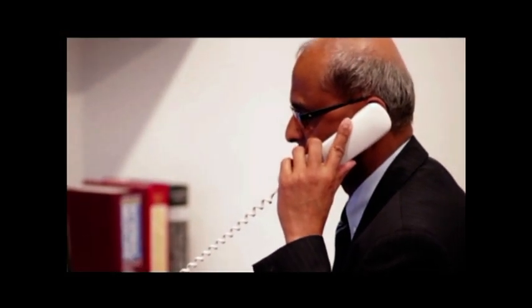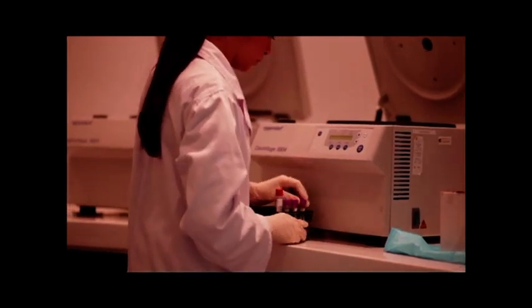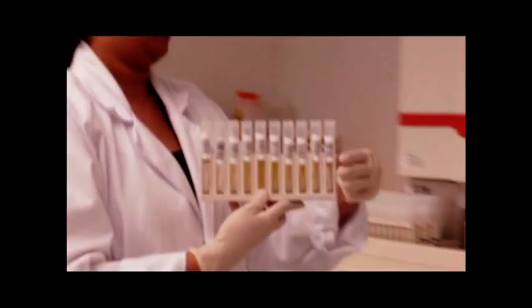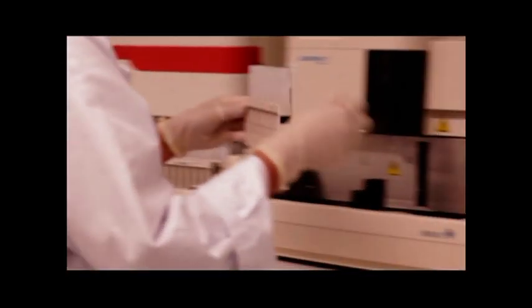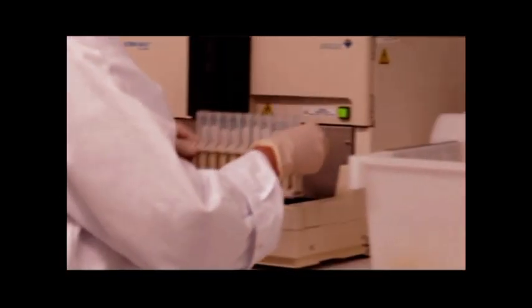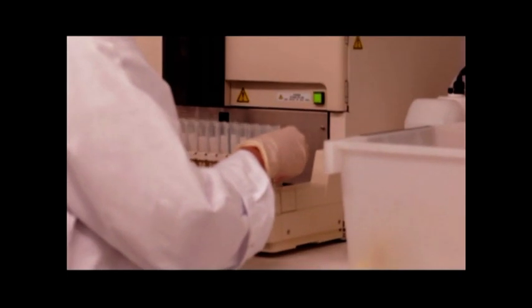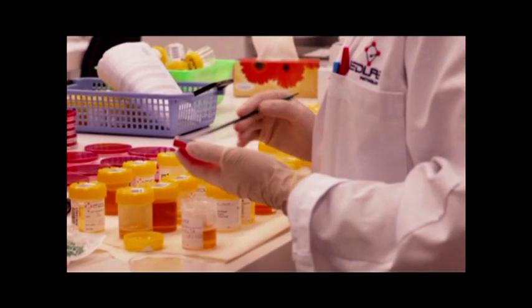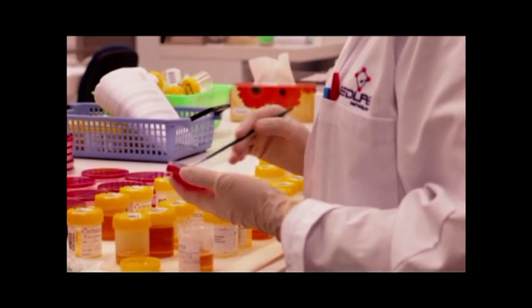MedLab Pathologists, Senior Scientists and Lab Technicians are highly trained and experienced. They ensure the laboratory meets and exceeds all the requirements of the relevant accrediting bodies.